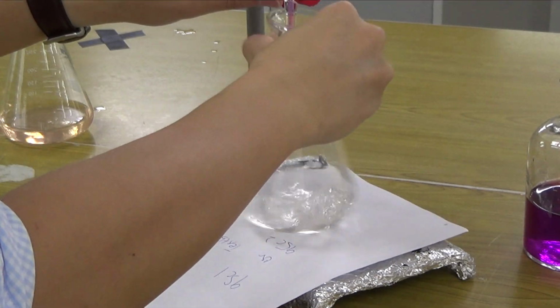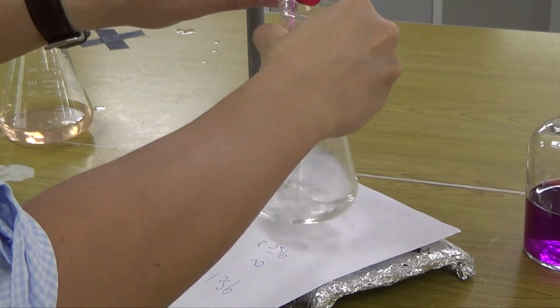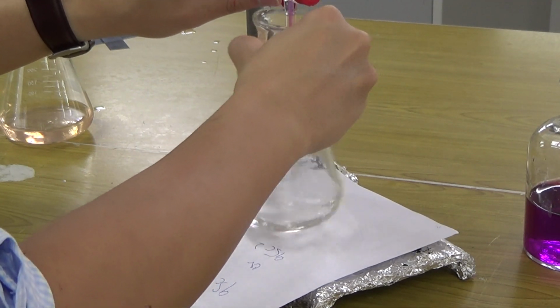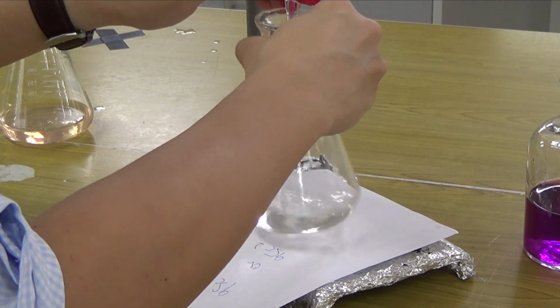And you want to swirl. You want to let it swirl. I'm right-handed, so I'm swirling the conical flask with my right hand, and my left hand is continuously on the tap, and then when it changes color, I stop. I don't do the reading yet. I don't care about the reading. Do not take your eye away. So just keep on swirling.